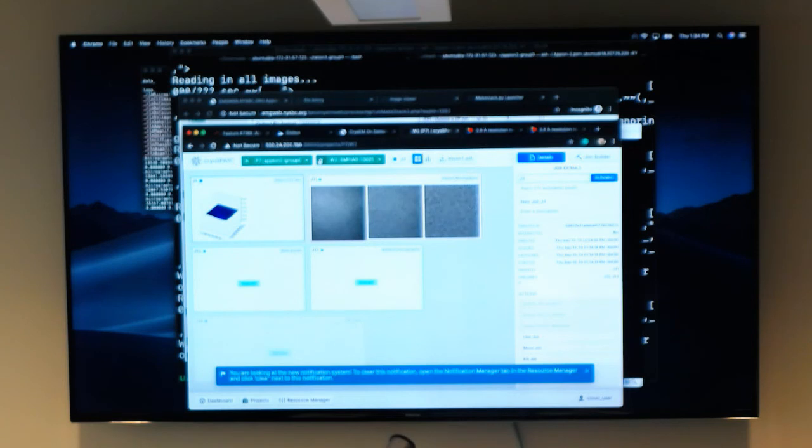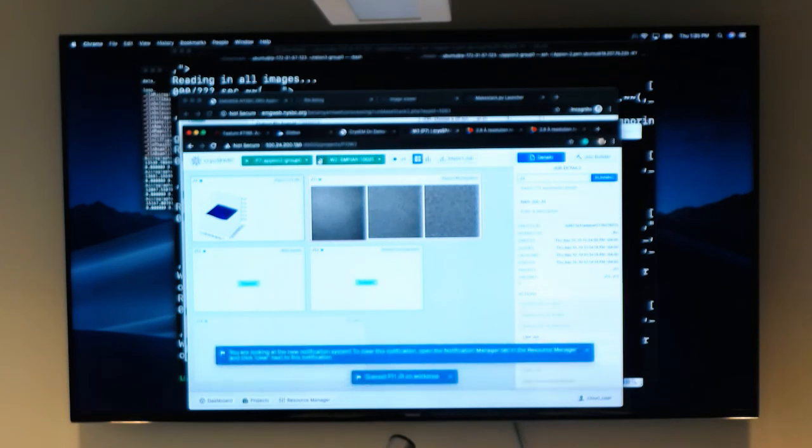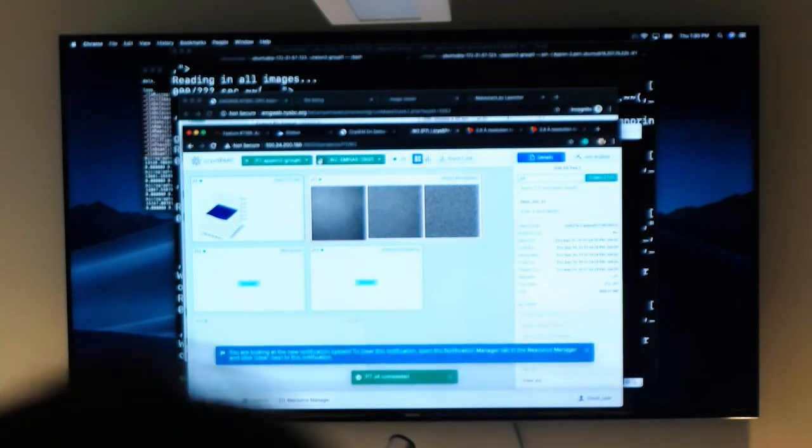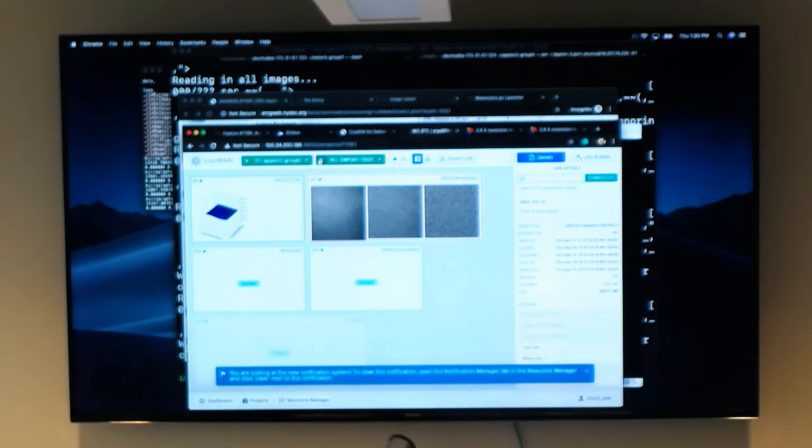I think you see the one very high here, and you have only run the heterogeneous. When you run it, it actually has a control line, but not as good as the homogeneous one. This one probably should be good. For the first model it's very low, and the second model is really good.